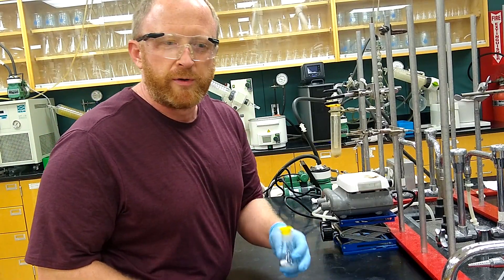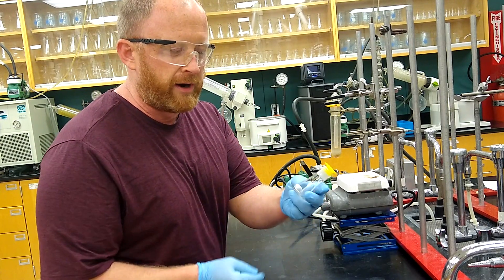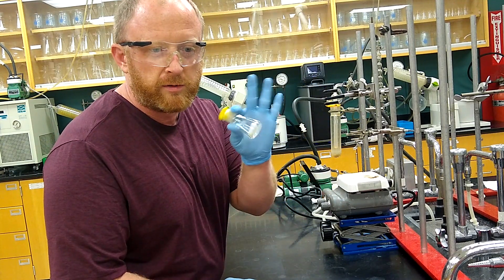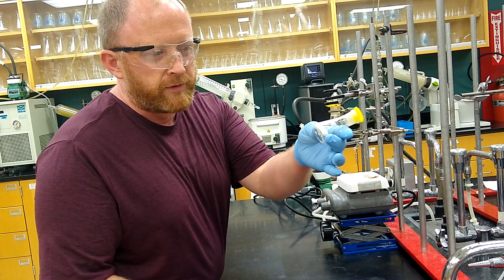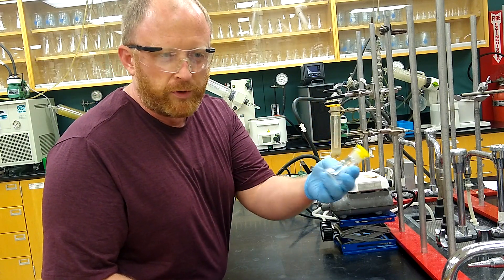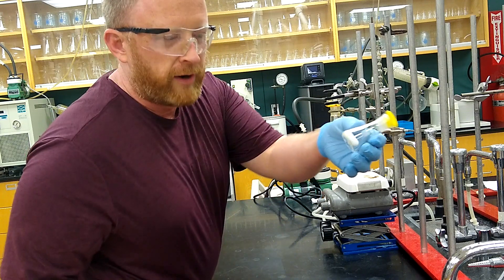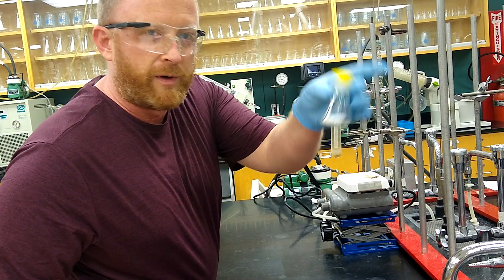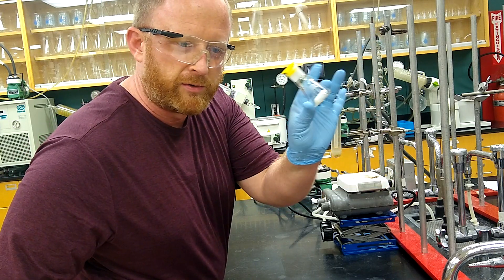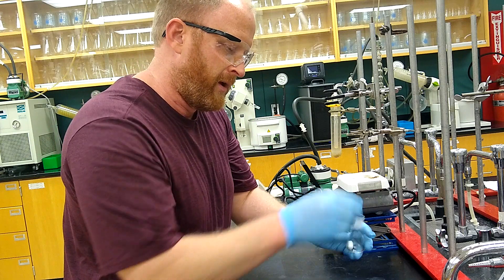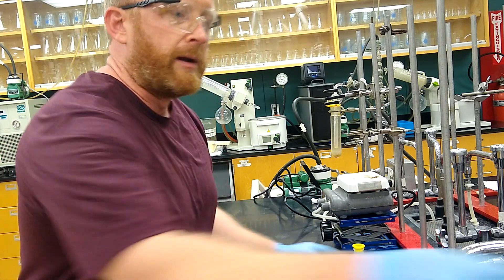The first thing we want to do for the procedure is measure out our cresol, p-cresol. It's a solid at room temperature but has a really low melting point, so I just heated it up and transferred it over by pipette. I've got cresol in a 25 mL conical flask with a stir bar.